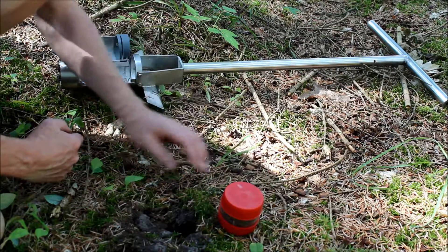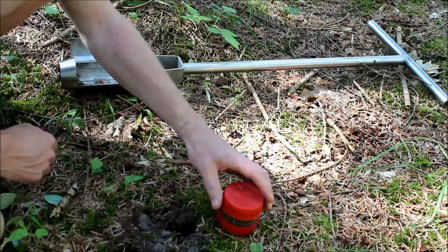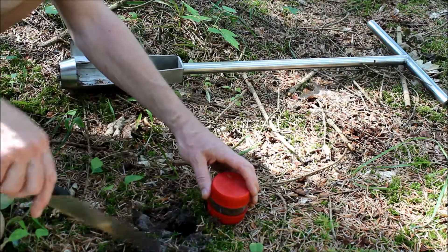Sometimes there might be a lot of roots, and you have to cut through them with a knife, and then you can choose to not use the soil corer.